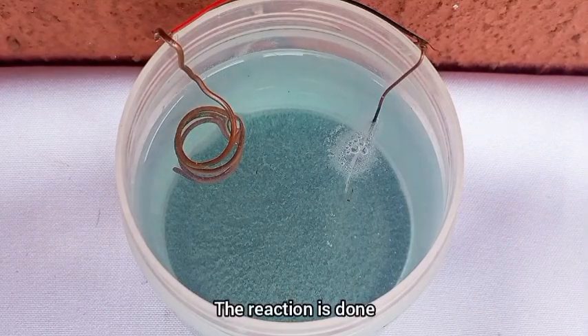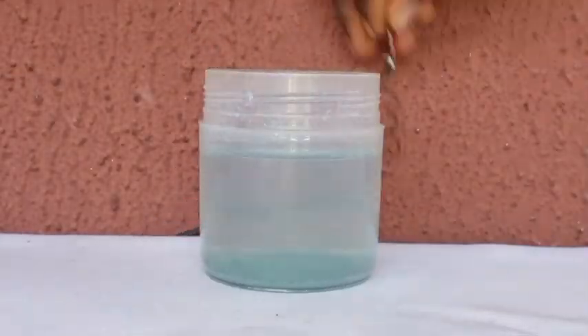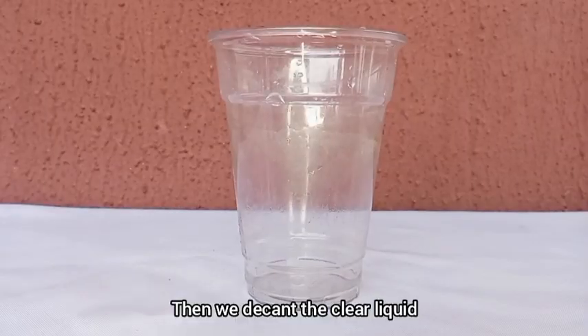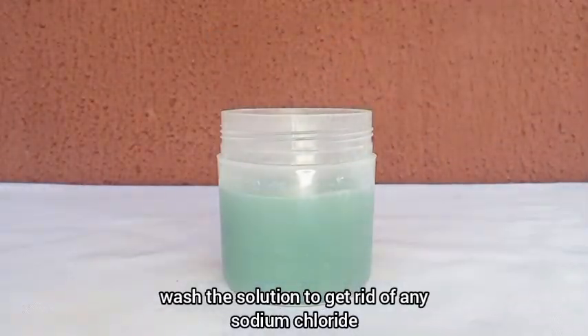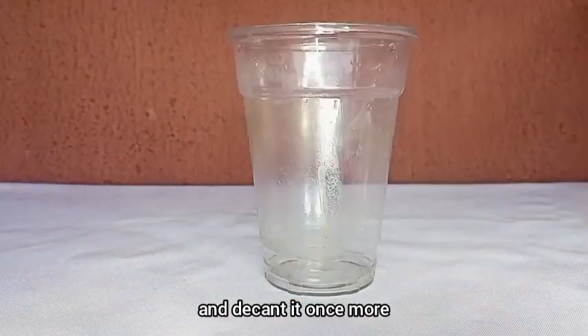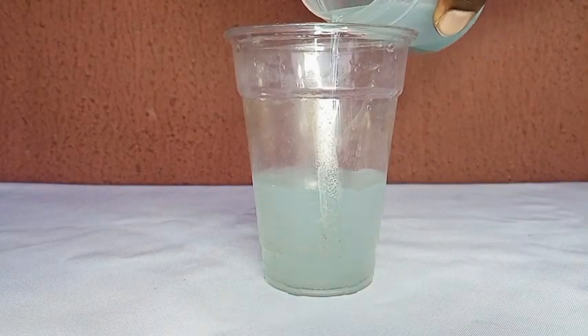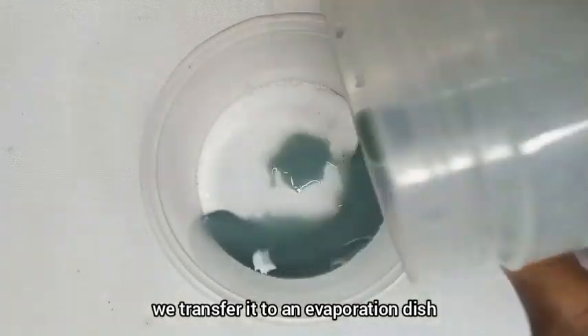The reaction is done. We disassemble the setup. Then we decant the clear liquid. Then we wash the solution to get rid of any sodium chloride, and decant it once more. Once that's done, we transfer it to an evaporation dish.